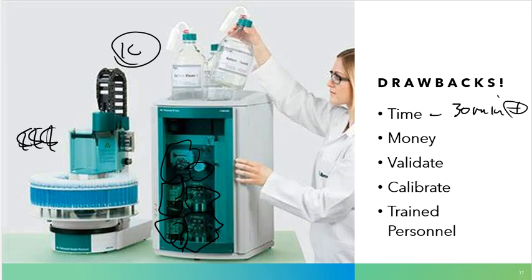So money is also an issue. Compare that to general reagents that are just solutions that I can quickly make and then just dump what I don't need. It's not going to be very wasteful as far as the wallet goes, and those are very often much cheaper to do than the instrumentation pieces listed in 191.